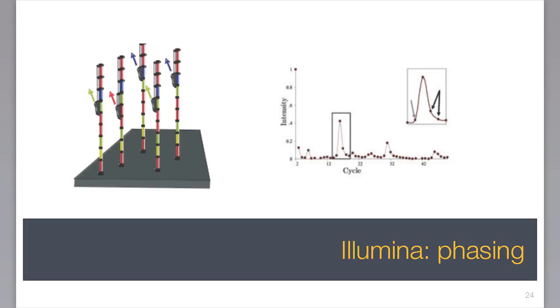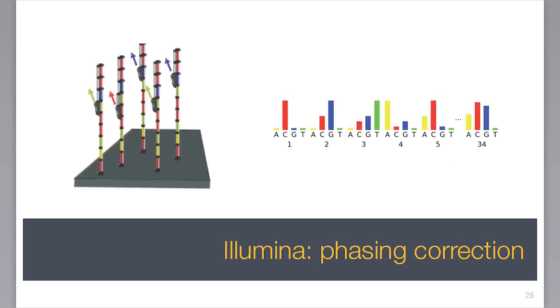And there's something called phasing. That means, again, it's a biological process how you read those things out. At the first step, you do your first measurement, 99% of your substrate gets modified by your protein or enzyme. 1% doesn't. It either lags behind a little bit or it goes faster and skips ahead. So with each step, you add maybe a 1% error rate. And by the end of your read through a little sequence, your whole signal is actually completely out of phase.